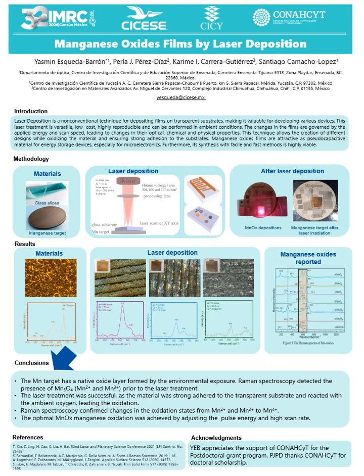Raman spectroscopy confirmed changes in the oxidation states from manganese 2 and manganese 3 to manganese 4. The optimal oxidation of manganese oxides was achieved by adjusting the pulse energy and high scan rate.